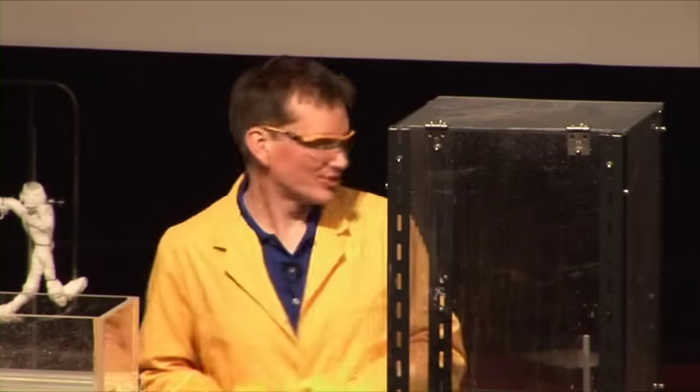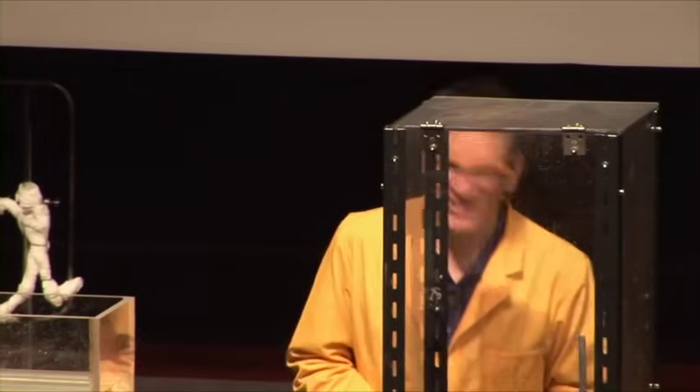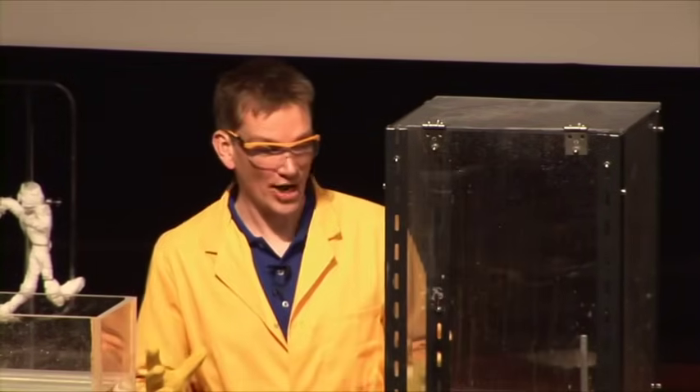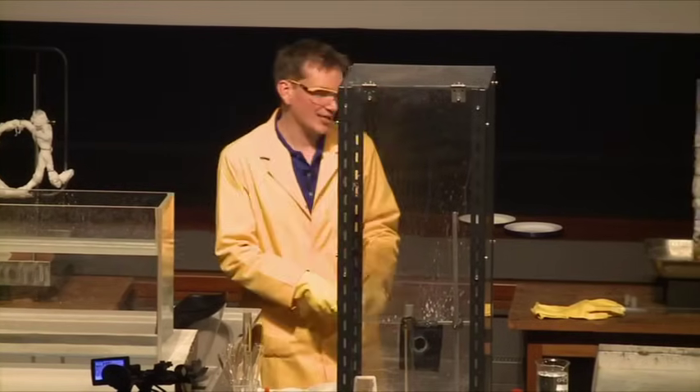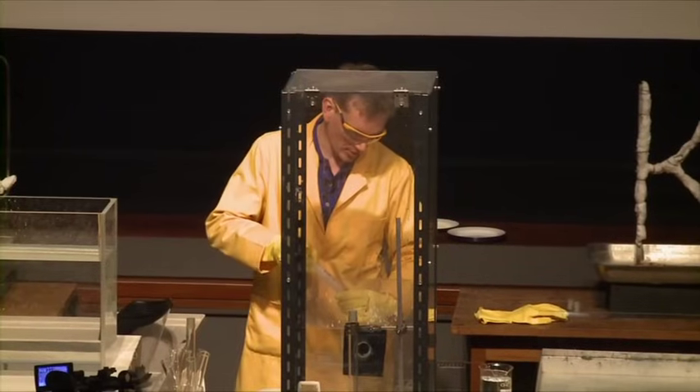We're going to use the same quantity of metal every time — not the same mass, but the same number of atoms. So Mark has very carefully counted out the same amount each time. We're going to start off with lithium, and I'm going to add the same quantity of water every time — 10 mils of water to our metal.